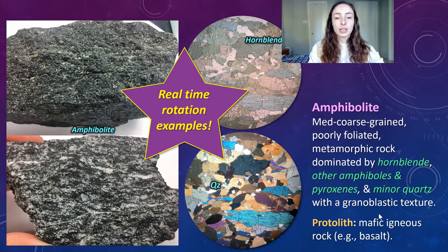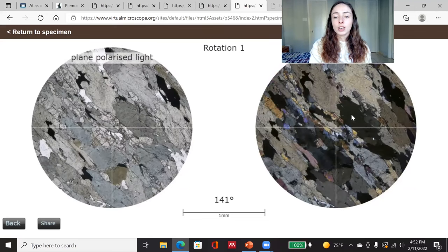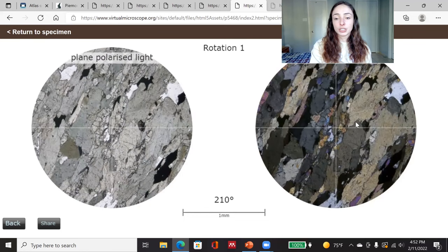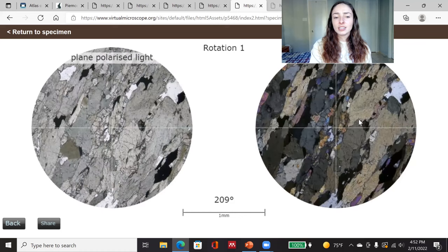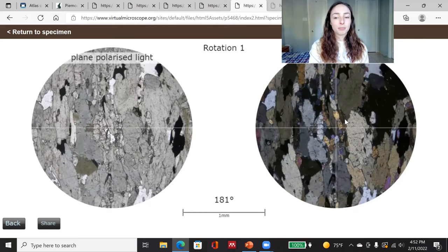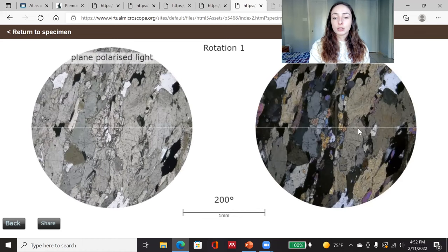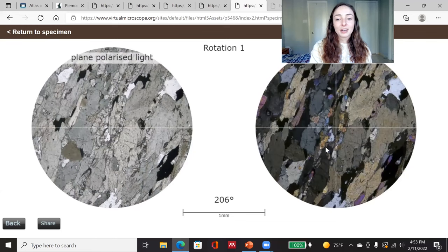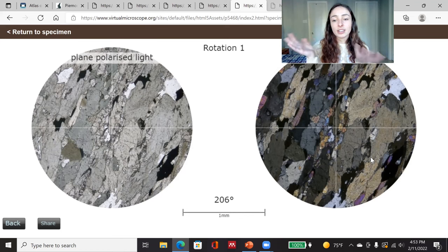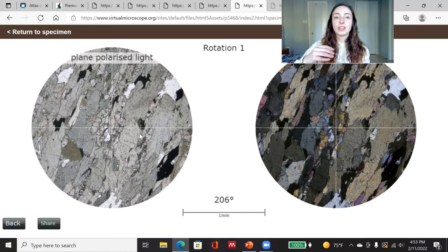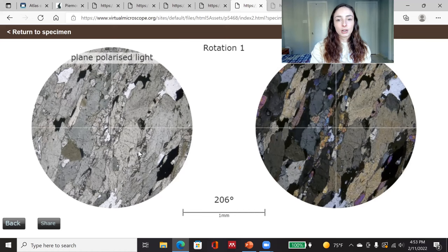Here are some real-time examples of amphibolite. This first sample is a little more flattened, indicating probably a higher-pressure scenario of metamorphism. These have less bright interference colors than the sample in the PowerPoint, probably meaning slightly different minerals. But it's still an amphibolite — it's still brighter colors than black and white quartz. You can also tell by plain polarized light that it has a greenish-tannish color, and it's more blocky and larger than biotite, which is more brownish-goldish and platier in banded grains.